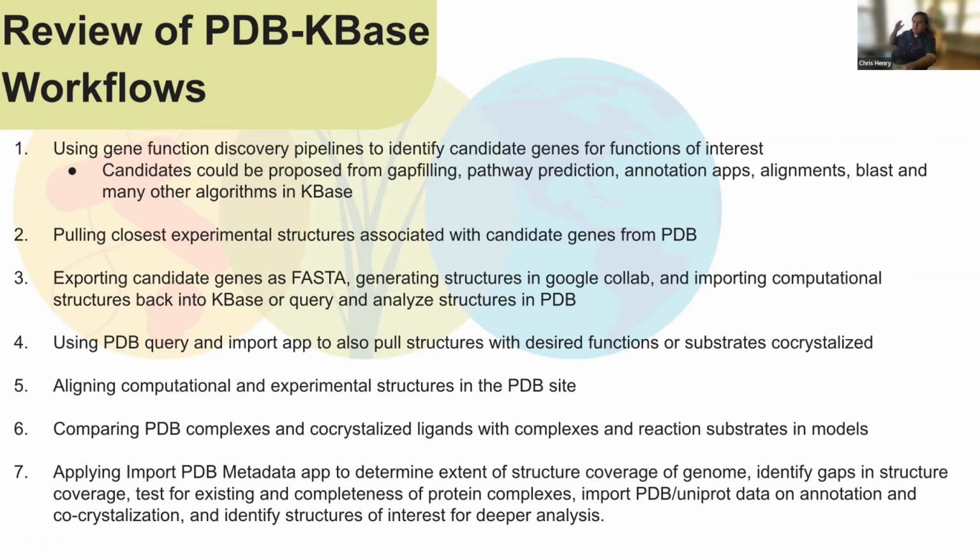You can generate an AlphaFold structure for your sequences in KBase, many of which will be totally new and never seen before, because they're from an isolate or from an environment. And then not only see if that sequence is homologous by sequence to a gene in PDB or in other resources, but actually see if it's homologous in structure, and when there is variation, where is the variation? This is the lovely presentation that Shuchi showed, how you can see the sequence variation and where it lands in the structure using that 1D, 3D tool.